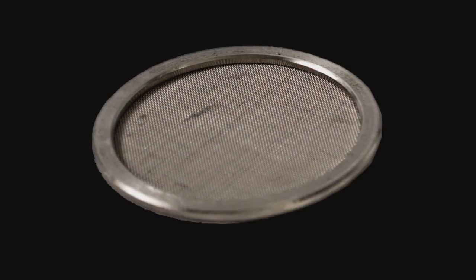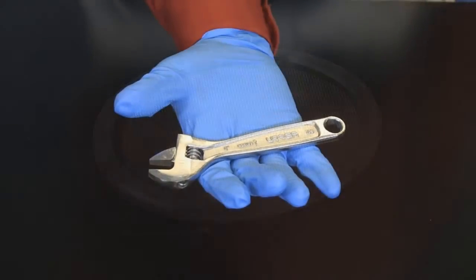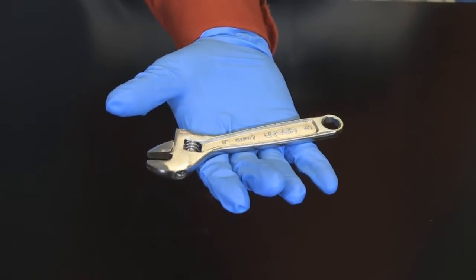Here's another simple innovation. The filtrate screen is now separate for easy cleaning or replacement. And here are the tools needed to operate the Safe Cell.